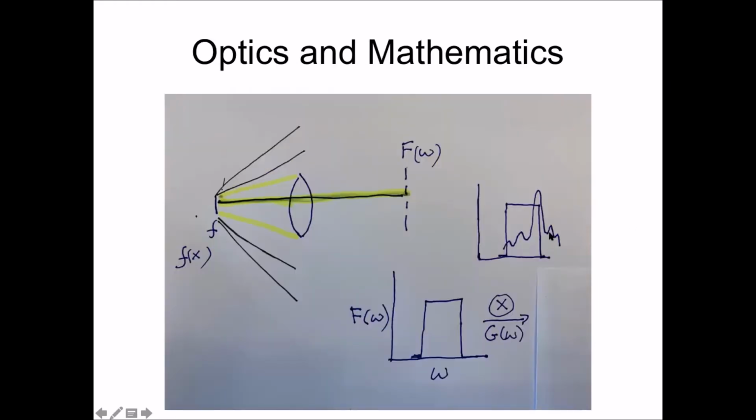And so what this really says is that in a lens, you, for various reasons, don't collect all of the light. You don't collect the evanescent fields. Some of the light goes out of the lens because it's an aperture, okay? And you usually see a particular frequency of light in the Fourier plane.